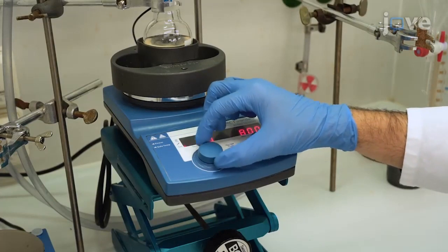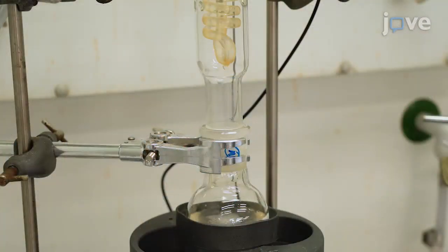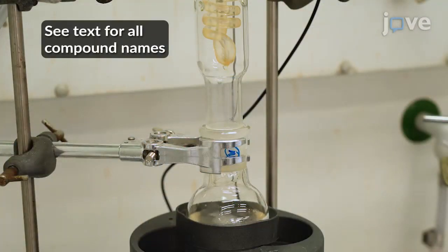Continue stirring for 10 hours at reflux to obtain a clear, colorless solution of glutaramide compound.